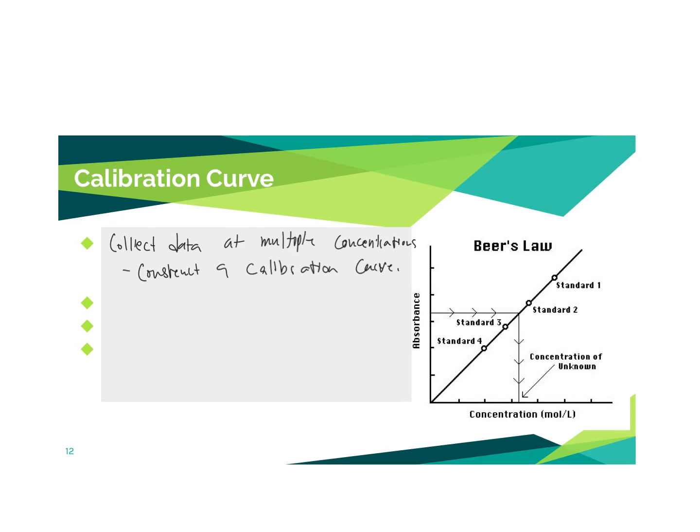Now, this is a little bit misleading because this should be linear. It isn't really necessarily a curve, but what you do is you plot your concentration of your sample versus the absorbance at each concentration. You do this multiple times. So here we have standard 1, 2, 3, and 4. And what you'll do is you should generally see a linear plot like this, where, of course, if here we have absorbance and here we have concentration, this line here, the slope is equal to epsilon, or the molar absorptivity.